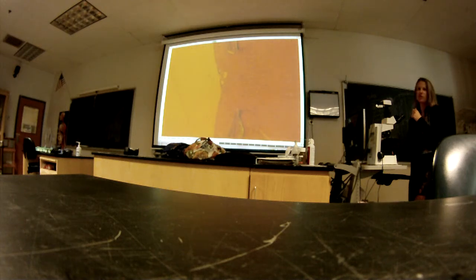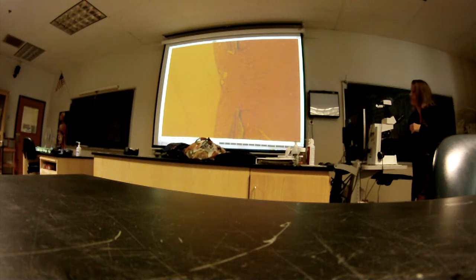Okay, that was the structure that we looked at in the cow eye. You were supposed to probe the retina, the white flimsy part, and I was trying to get you to hang the retina off, and then you can see how it all gathered and was connected back at the optic disc. Okay, so let's go anteriorly.